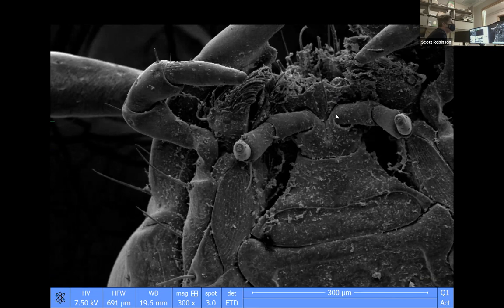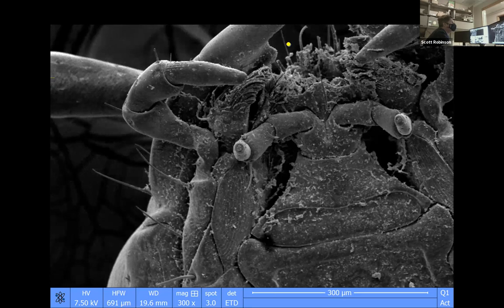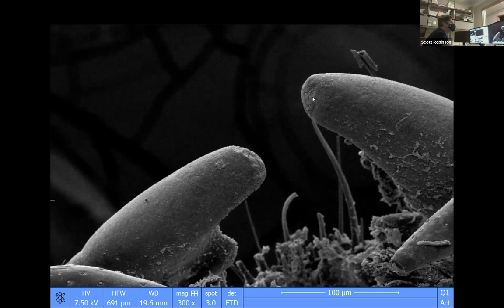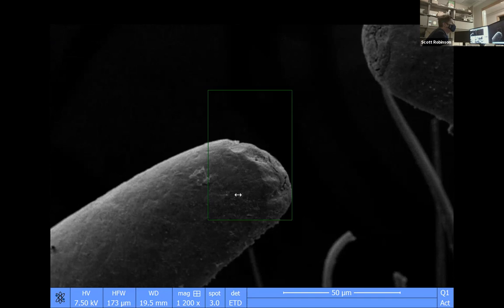And then you can see also that it has fangs. These are the mandibles up here on the top. Yeah, you can definitely see that the larger palps definitely aren't connecting to the mandible structure. So I don't think those are mandibular palps. And we can see where the mandible has been used. Sometimes the mandibles are worn a little bit. So these are the tips of the mandible.